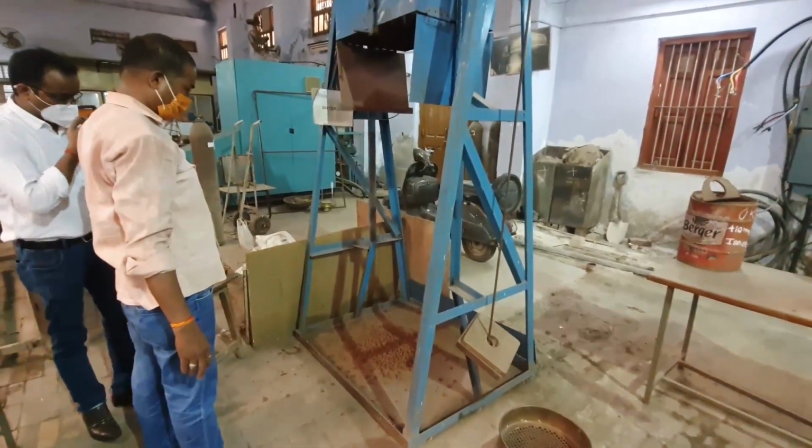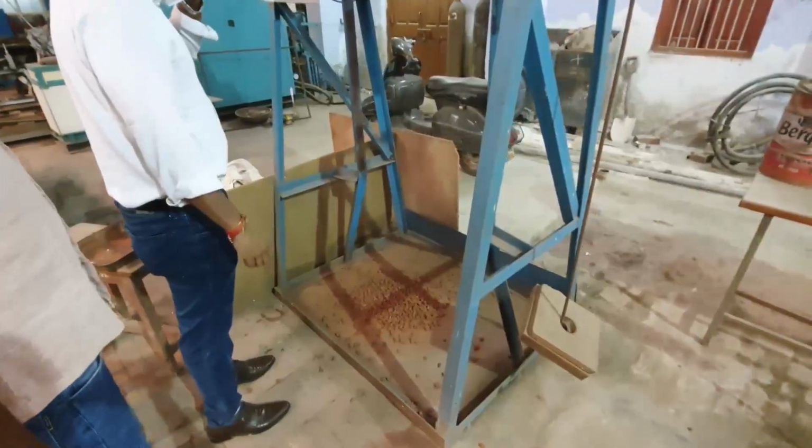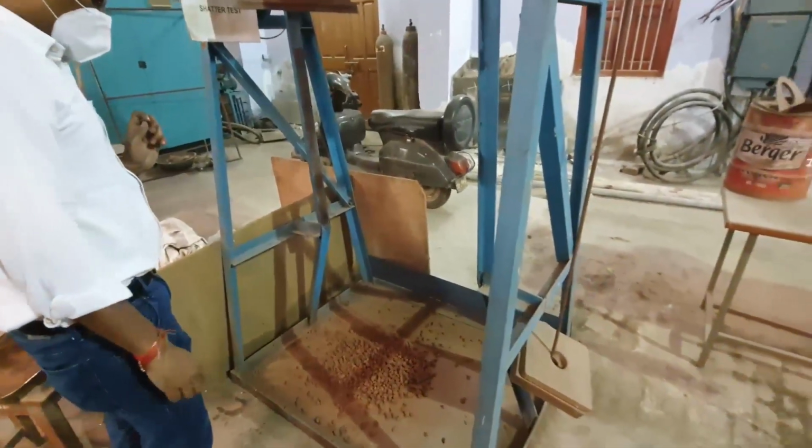This time, after collecting the material, we have to weigh the fraction, the weight fraction. Because 4 drops are completed, now we take this weight fraction to calculate the shatter index, the percentage of shatter index.